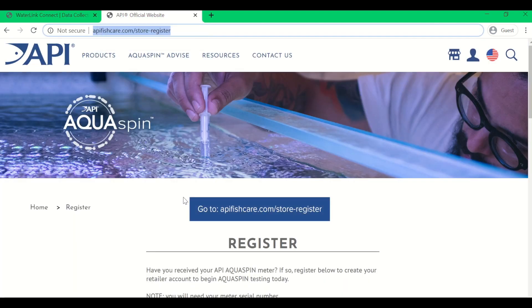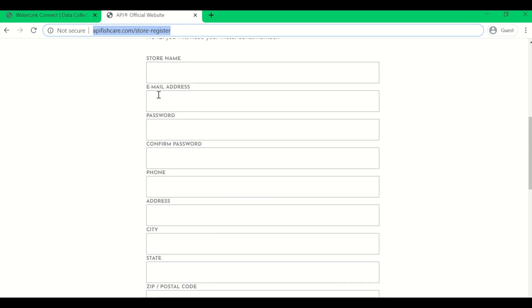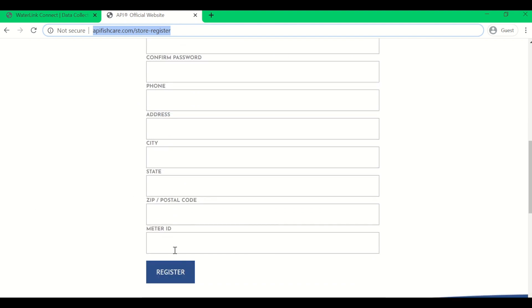Next, let's create your Aquaspin store login. You will want to go to apifishcare.com/store-register. Here you will complete all the fields required for the store registration. The one crucial field at the bottom is your meter ID, which can be found on your Aquaspin warranty card or on the bottom of your meter itself. You will enter in your meter ID and then hit register. This allows our system to create your username and password instantly, and from there you will be able to start using your Aquaspin meter and testing on the apifishcare.com website.